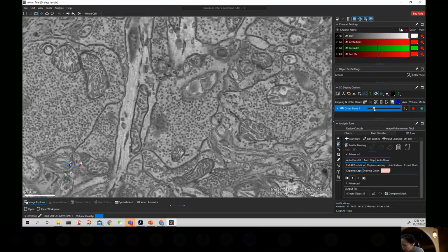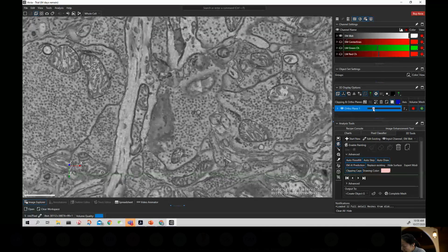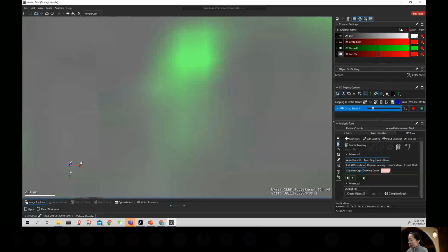And as I'm moving a little bit, did you see this bar shape, a dark gray bar shape? This is called a ribbon. It's an indication that there's a synaptic connection. This is a synapse. So there's a beautiful synapse between the ganglion cell and the bipolar cell.